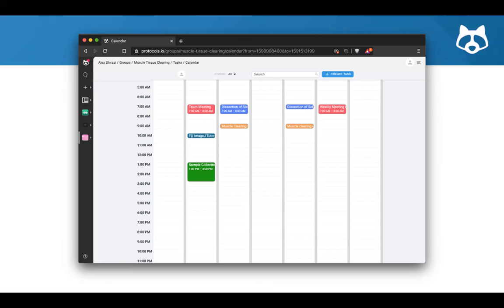If you have 10 people in a group, you can add the same protocol 10 times to that one task, and then every person can start one record, one run, and then you can see the different records of the different people. Please let us know if that didn't answer the question and we can explain more.